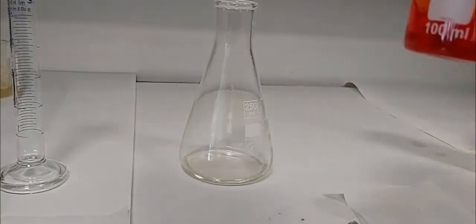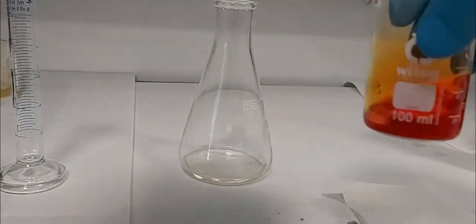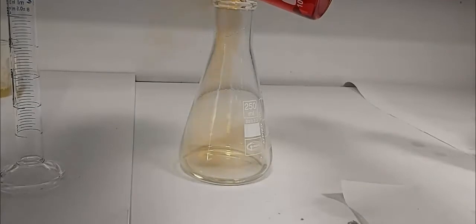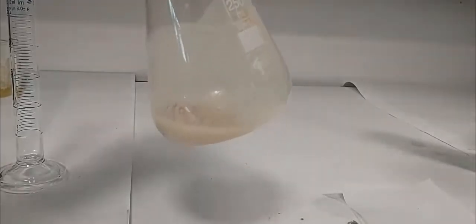We start adding this solution dropwise to the acetanilide solution, drop by drop. A precipitate is forming. By checking the solution you can see a precipitate is forming — the reaction is immediate.